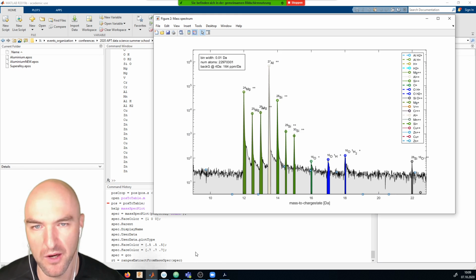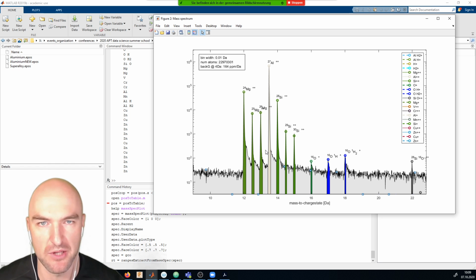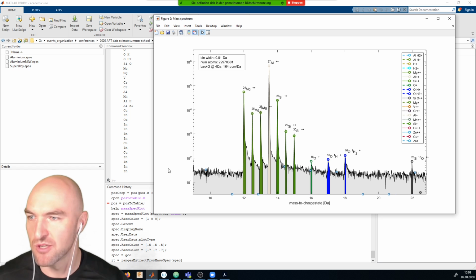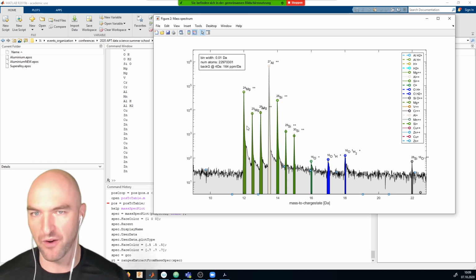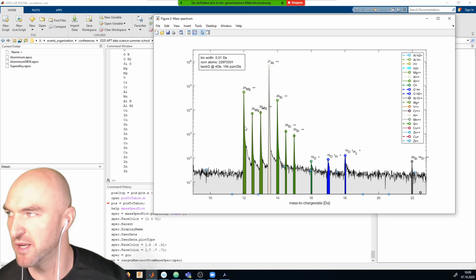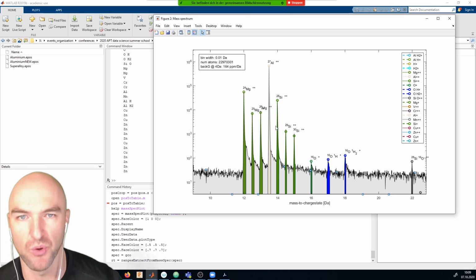And when you want to delete a range, what you literally do is just delete the graphics object. Or if you want to delete an ion, then you will just create that. So right now you don't need to worry about what file I'm working with. I'm just showing you things. Martina in the next session will actually show you how to properly create something like this.